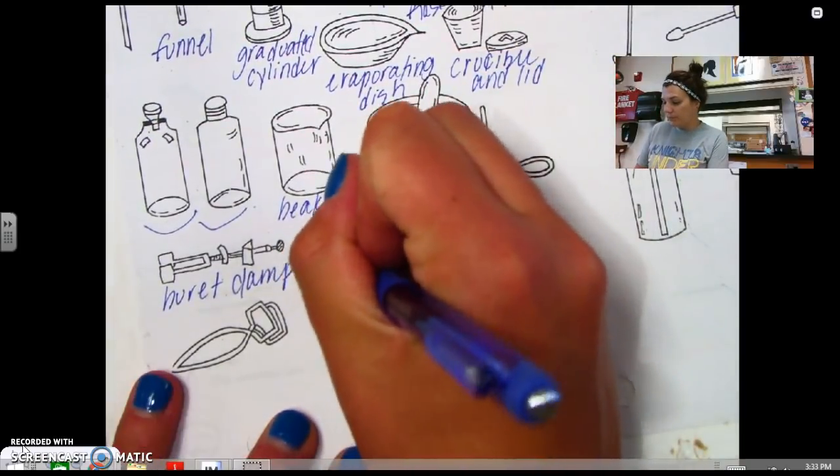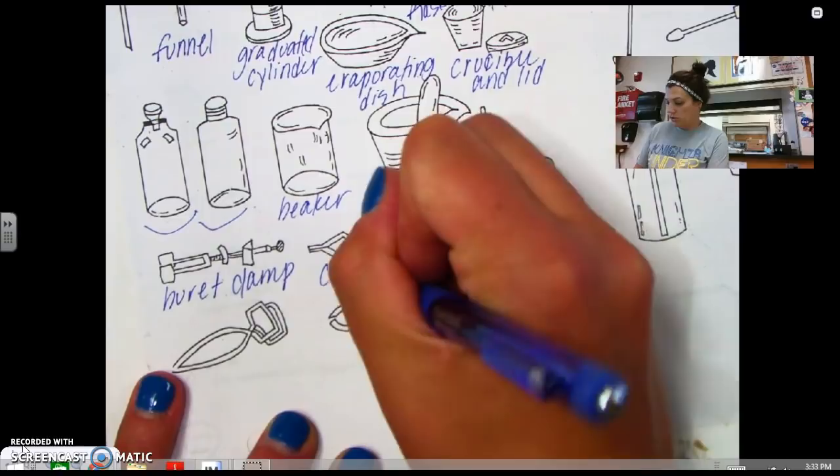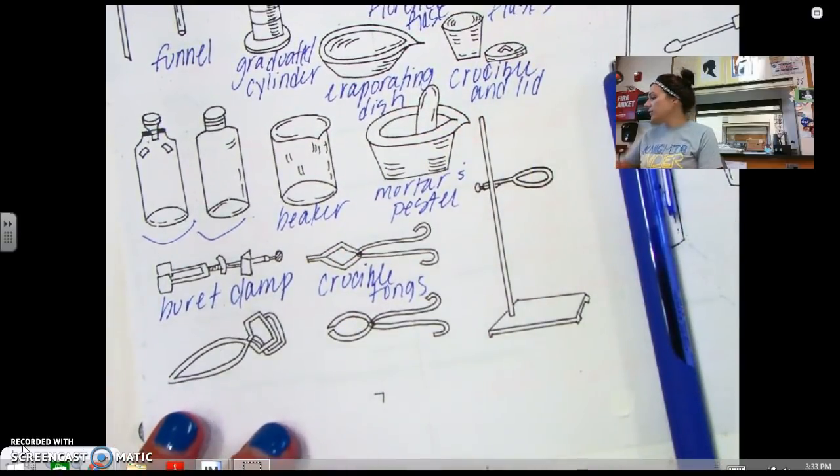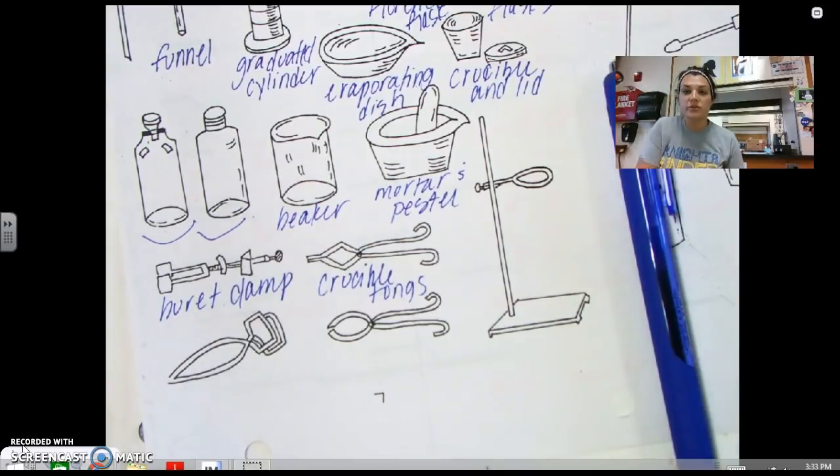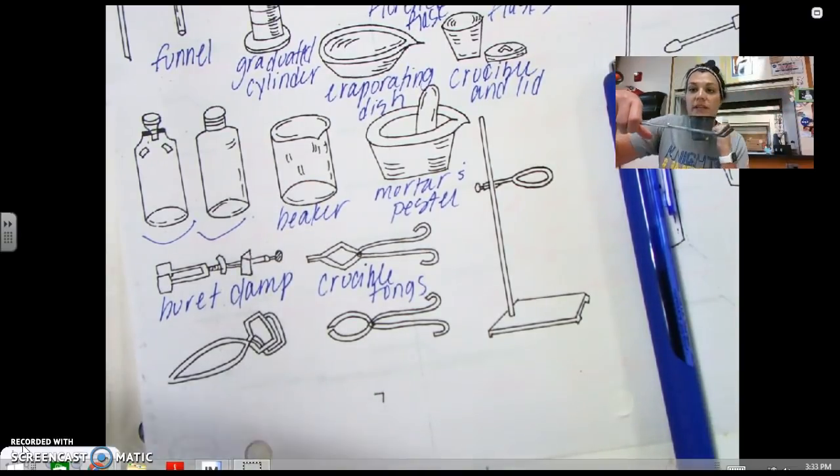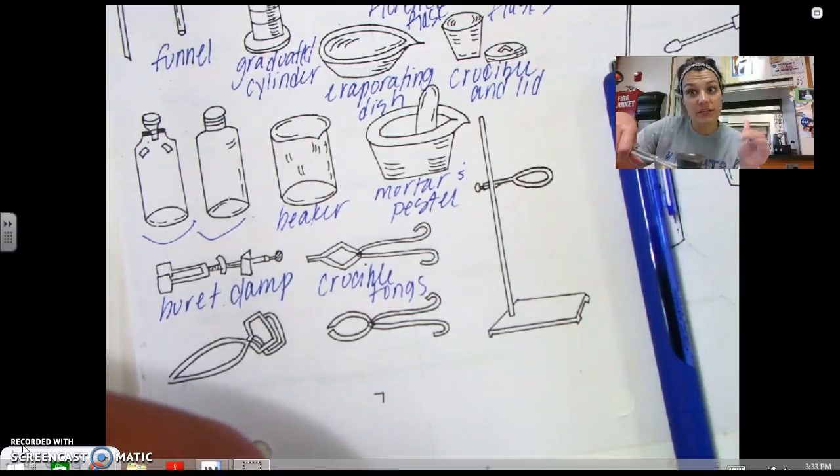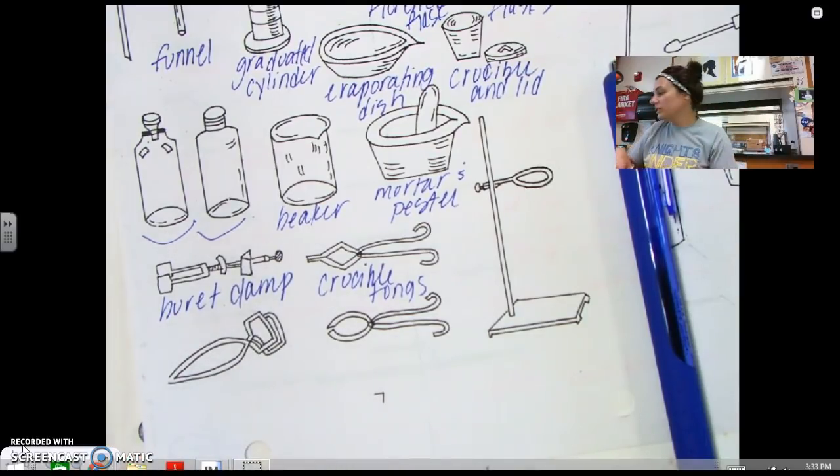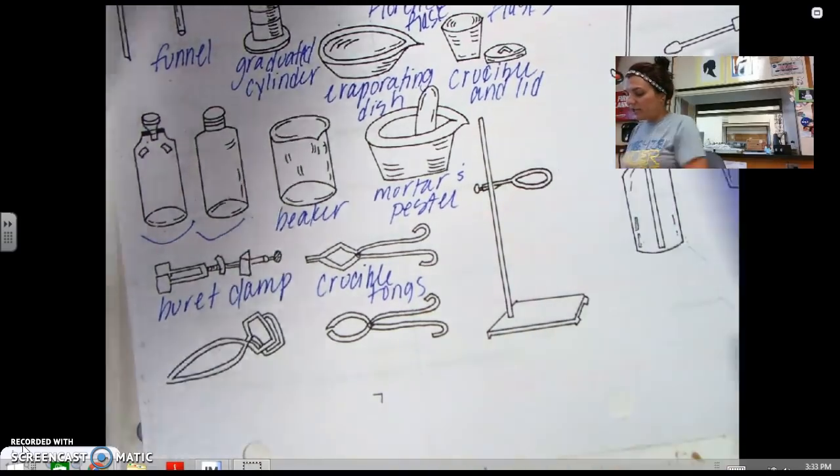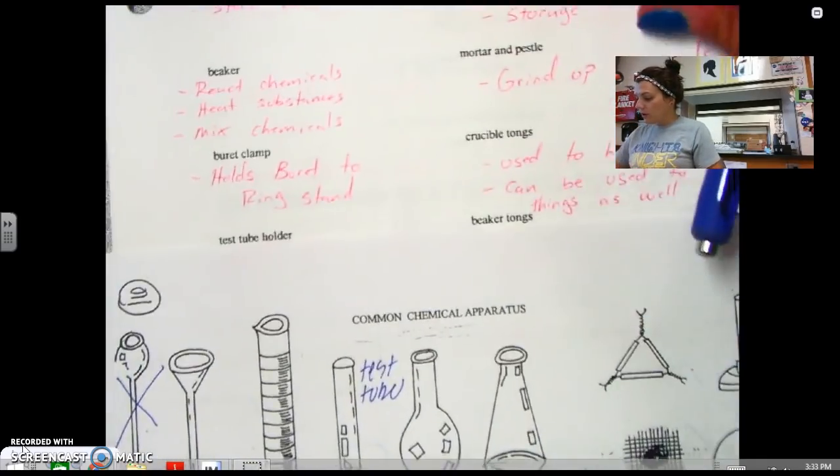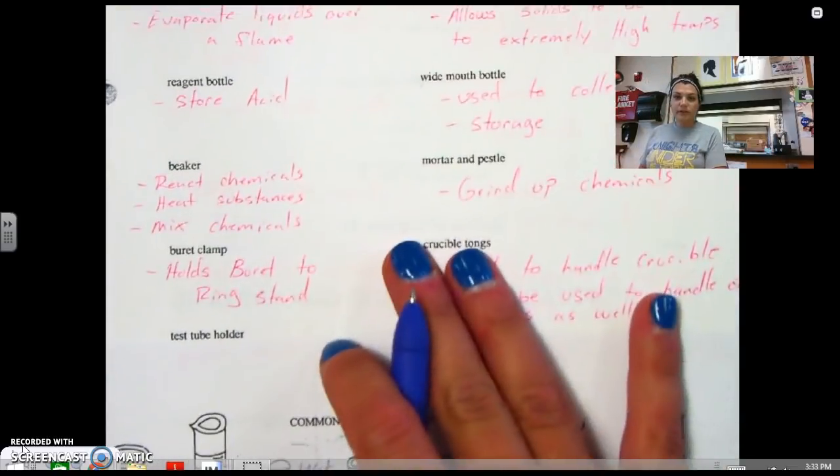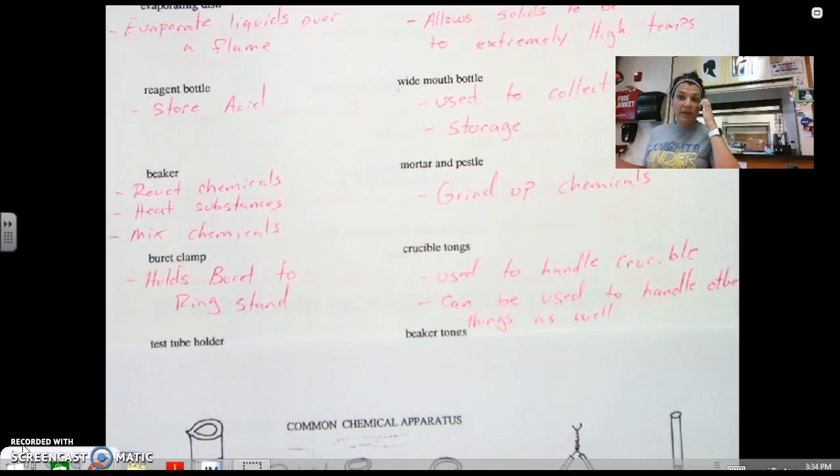The next thing is crucible tongs. Now crucible tongs, we talked about the crucible before. Crucible tongs aren't just regular tongs. So crucible tongs have that, it's like a little diamond. And it's perfect because what can happen is it can hold our crucible because remember what we use a crucible for is to heat things up. So when I take it away from the heat, I definitely don't want to touch it because it's metal and it'll be hot. So we'll need to use crucible tongs for that. So obviously crucible tongs are used to handle crucibles. And it can also be used to handle other things, but we tend to only use it to handle crucibles.